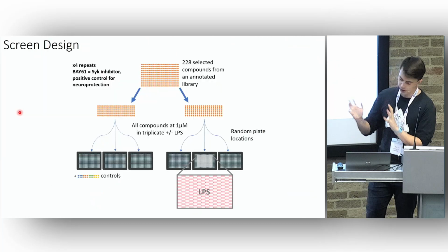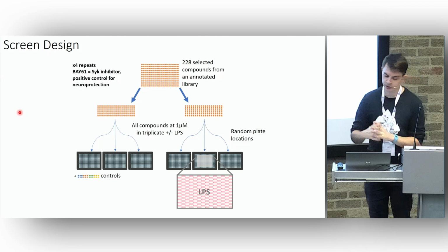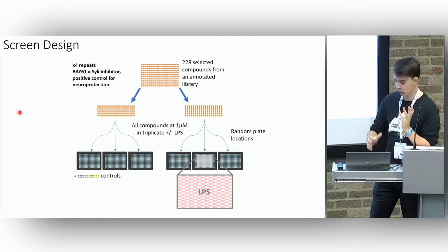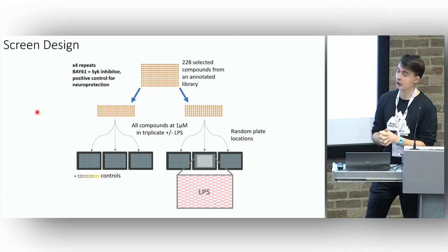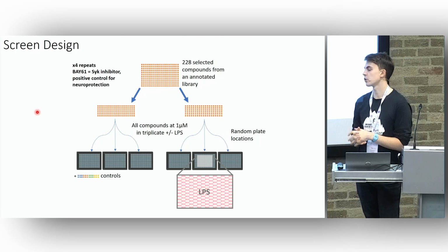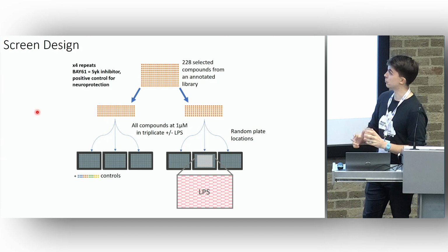So onto the screen. This is fully in collaboration with the ADDI, and they had the resources, the equipment, and the fantastic team there who helped me set this up. One of the other very important things they had is an annotated library. This is a library of compounds, many of which are in the clinic already, that have known on-target bioactivities. This is important for going from a hit to a cellular target of interest when you're interested in the cellular biology.